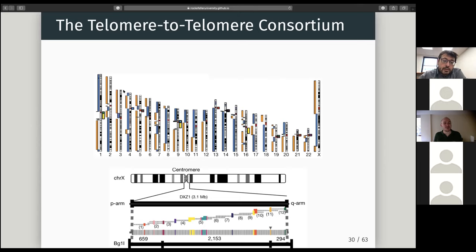Right. So I'm probably going to butcher that, but this is a human genome and you see the contigs and the gaps. So like chromosome one, you're missing the centromere. So the human genome is pretty much complete except for the centromeres, essentially. As I mentioned earlier, here is chromosome 8. You can see that's essentially finished. And chromosome X has been finished by a collaborator of ours. But more chromosomes need to be done, and this is the ultimate goal of the T2T consortium that Giulio is part of.